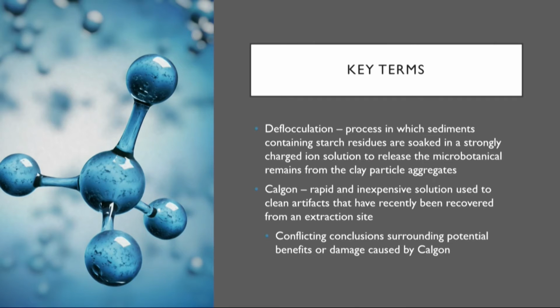sample was extracted. For this particular study, we used Calgon, or sodium hexametaphosphate, a rapid and inexpensive solution commonly used in the deflocculation process. However, there are various conflicting conclusions about the use of Calgon as a deflocculant, which we hope to address.